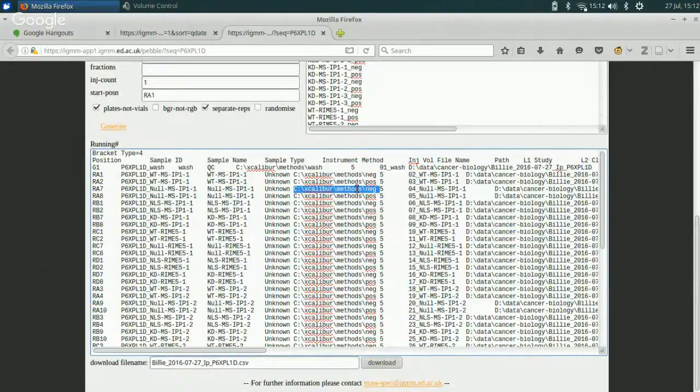If you're not using one of those, then maybe whatever you're doing, we could work it in as a core method and everyone can use the same set of methods. Anyways, if you're not using one that's there, then you'll have to still edit this in Excel or somewhere else.